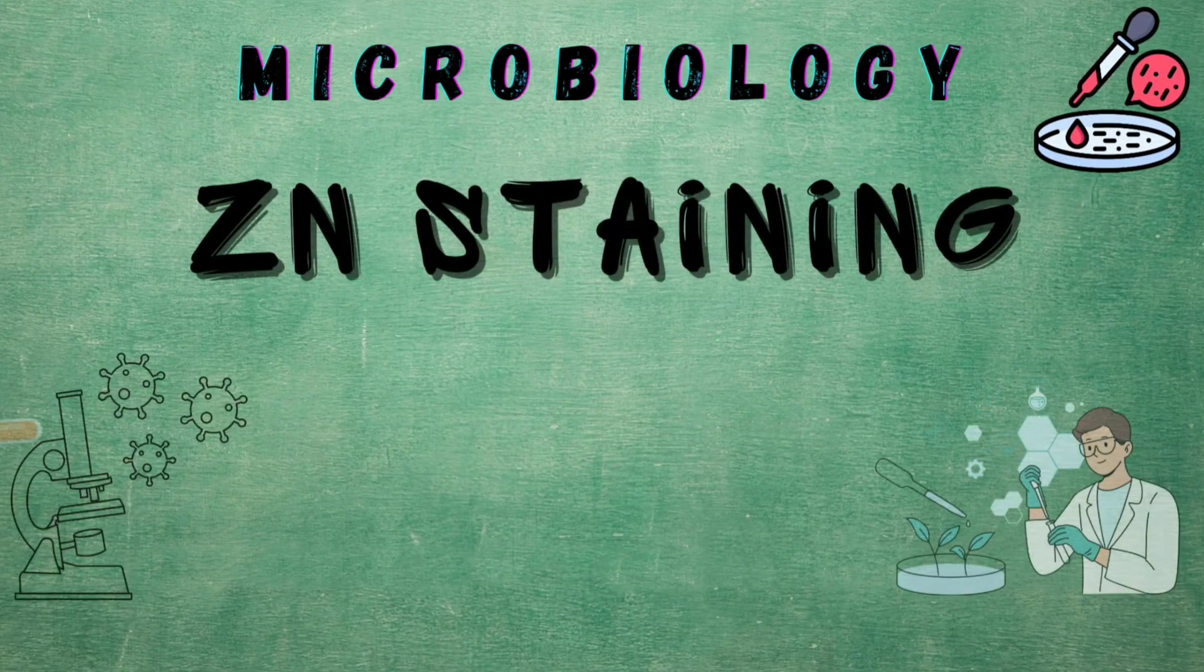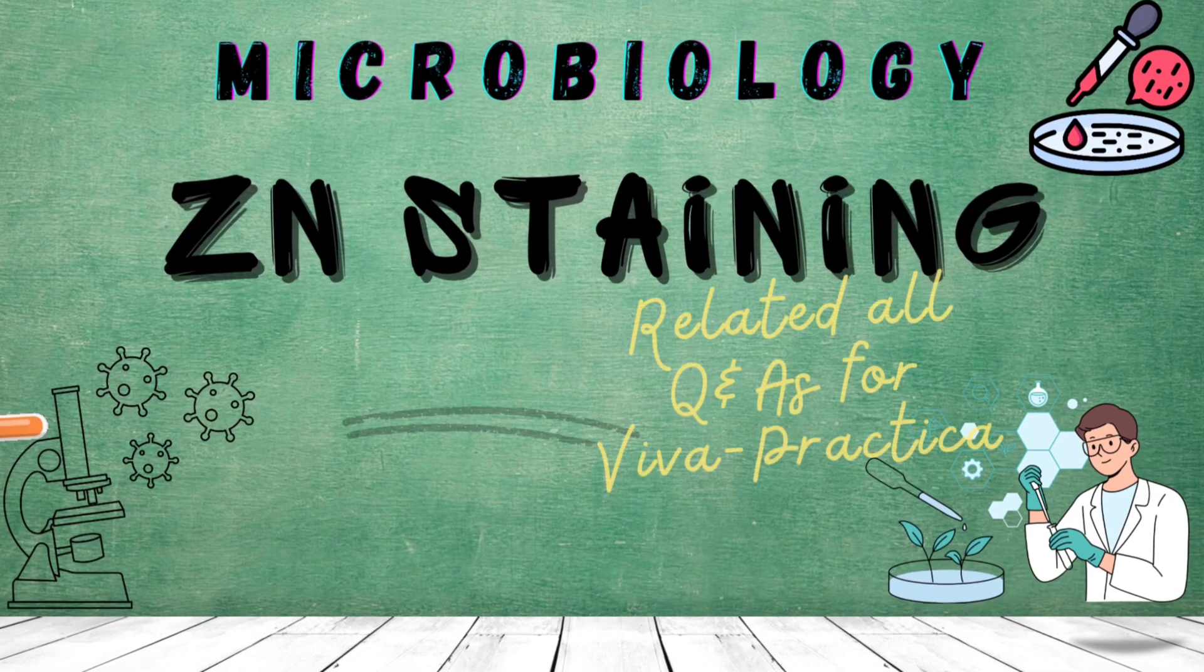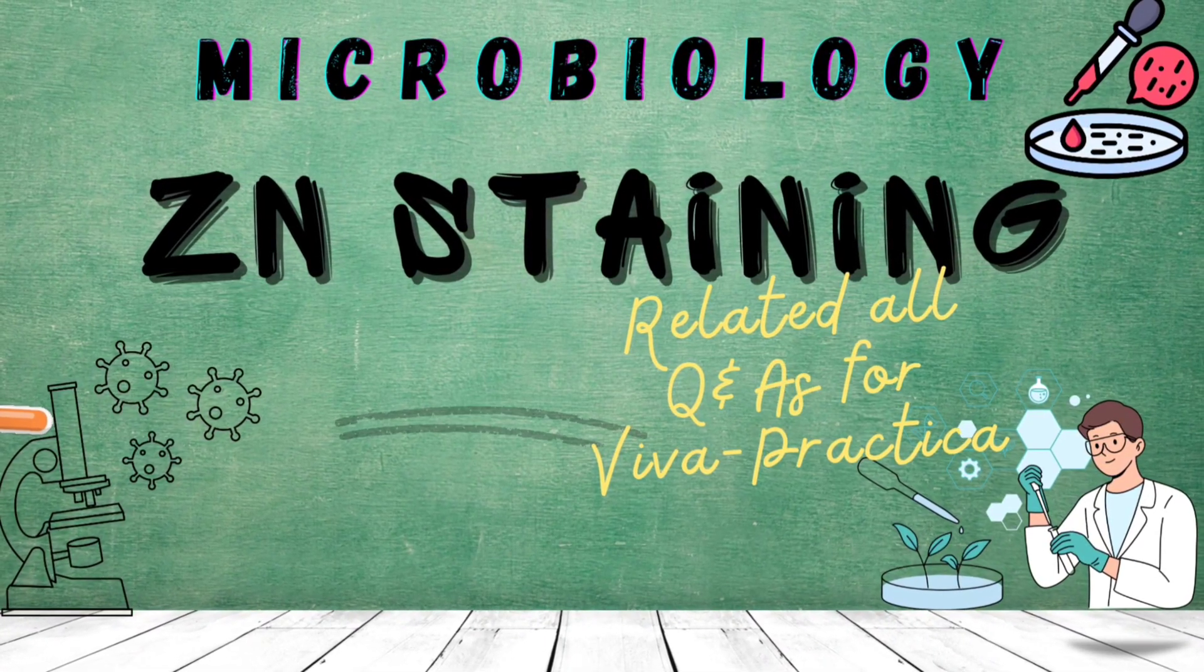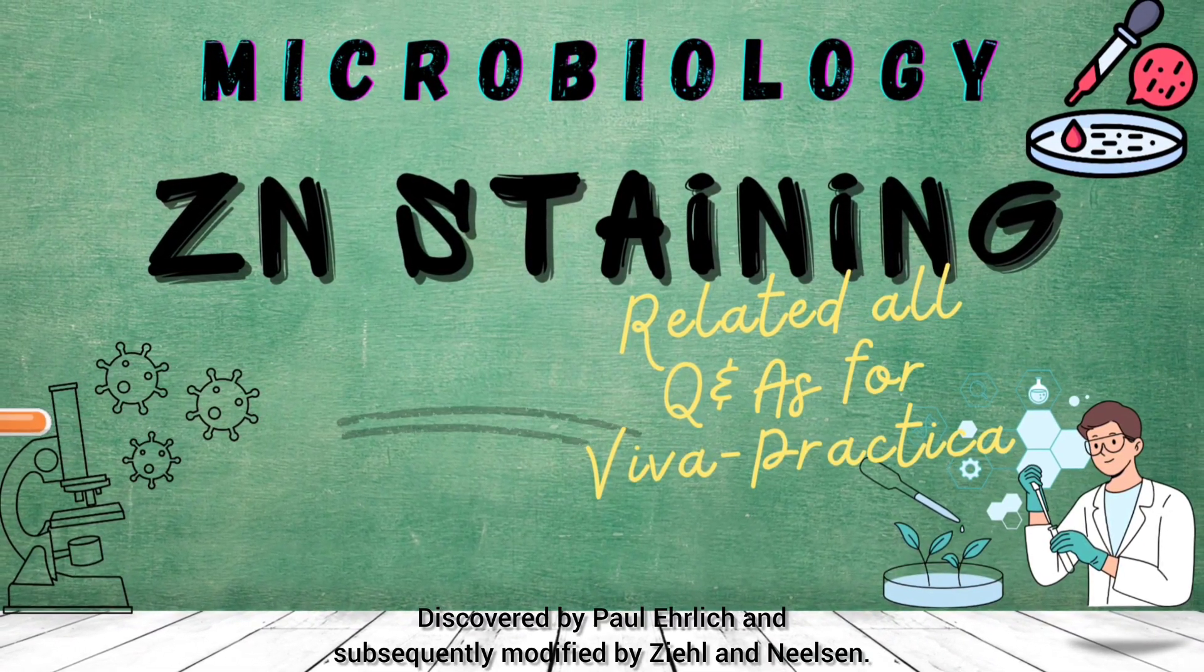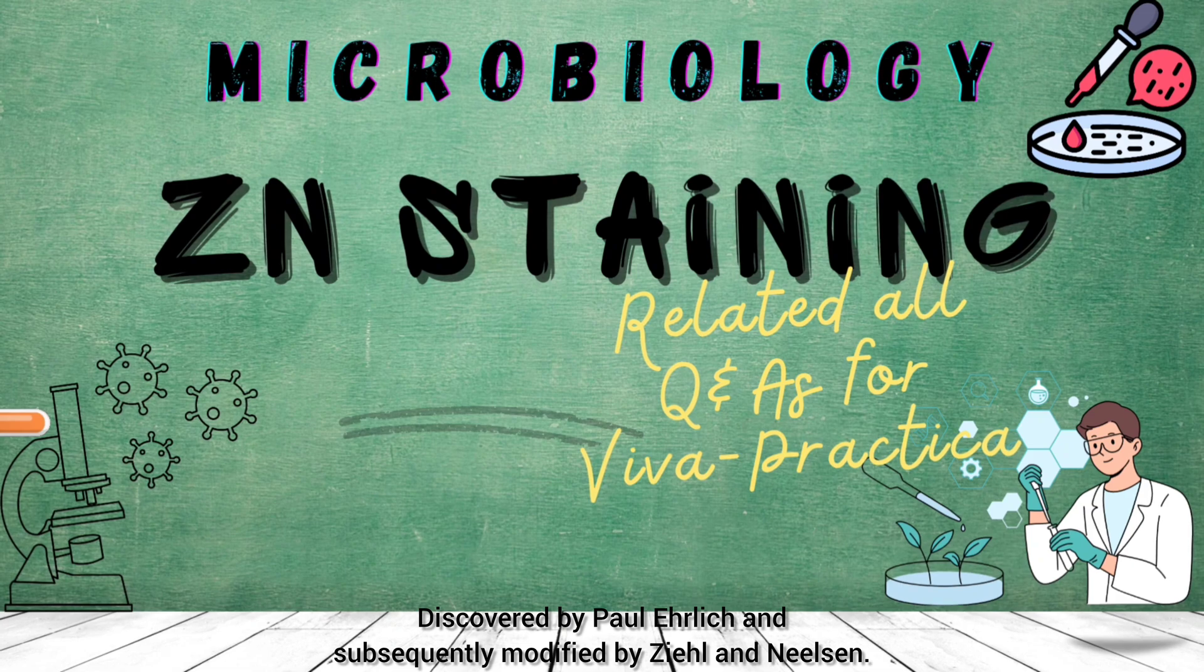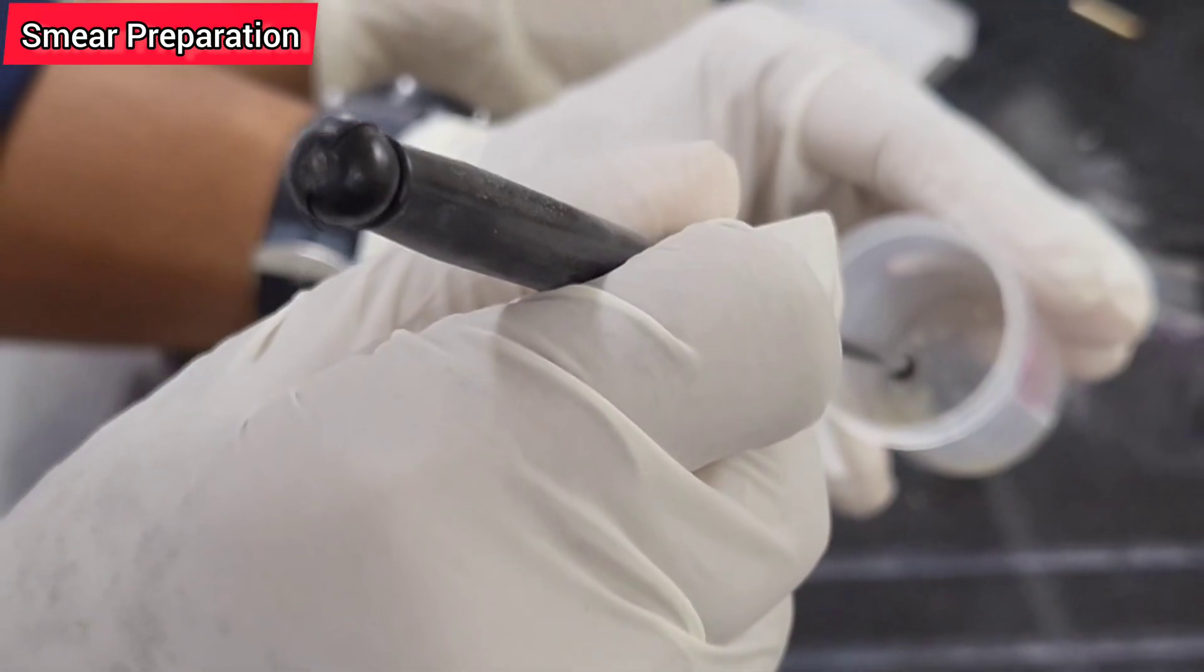Ziehl-Neelsen staining or Ziehl staining or acid-fast staining is a differential stain used to identify acid-fast bacilli. Discovered by Paul Ehrlich and subsequently modified by Ziehl and Neelsen. First step is smear preparation: place a sputum sample, mainly purulent part of sputum, on a clean glass slide with the help of sterile inoculation loop.